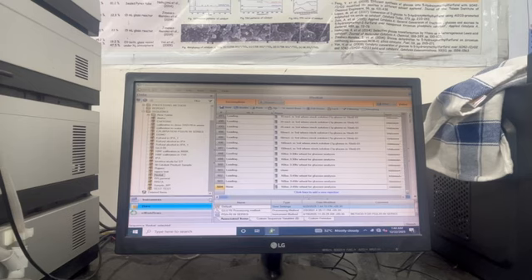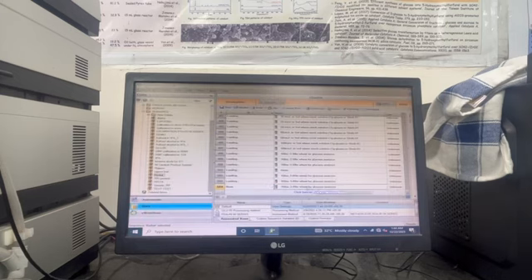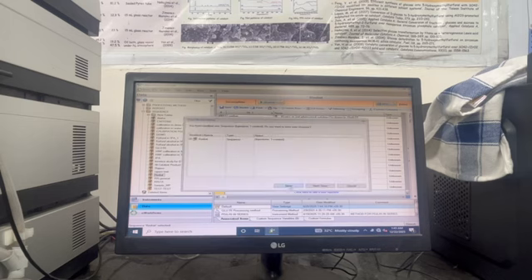Since we have created our sequence, in the data I can say this name as test, for example. Okay, so I will enter, then I will resume it. So as if it's continuing. Actually this is not a resume type of analysis, but I will click on the resume. It will ask me to save it, so I will say save it.